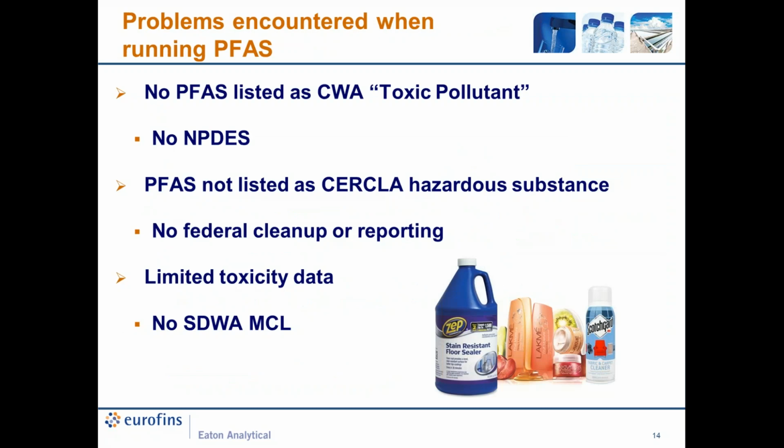Now I'm going to switch gears briefly and discuss some of the problems, as I see it, encountered with PFAS analysis. Mainly, the compounds are not listed in any regulation anywhere. There's a health advisory for drinking water, but no MCL and no promulgated method. There are no EPA-approved methods for RCRA or the Clean Water Act. This is causing a preponderance of lists and modifications of methods.